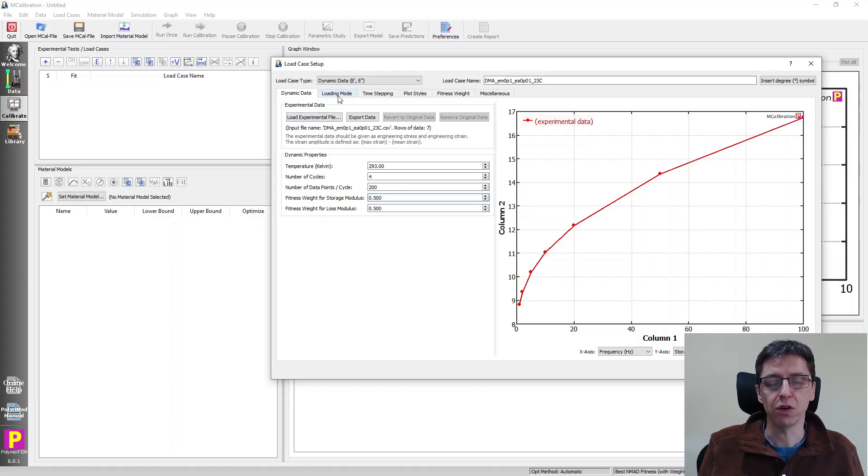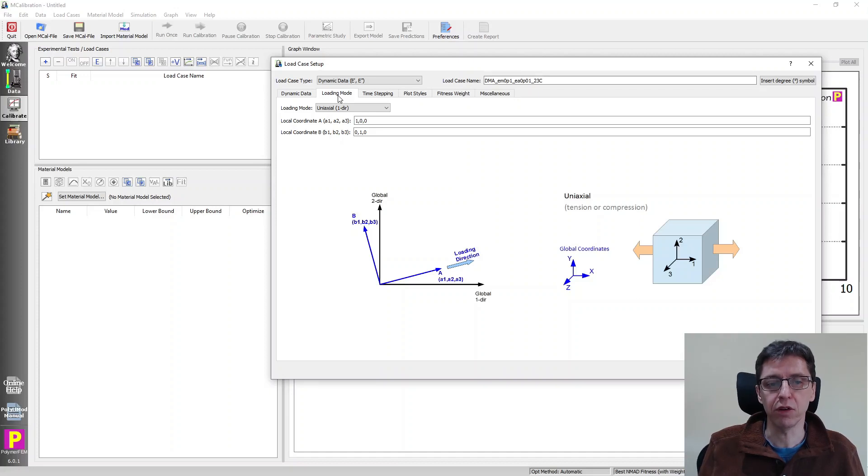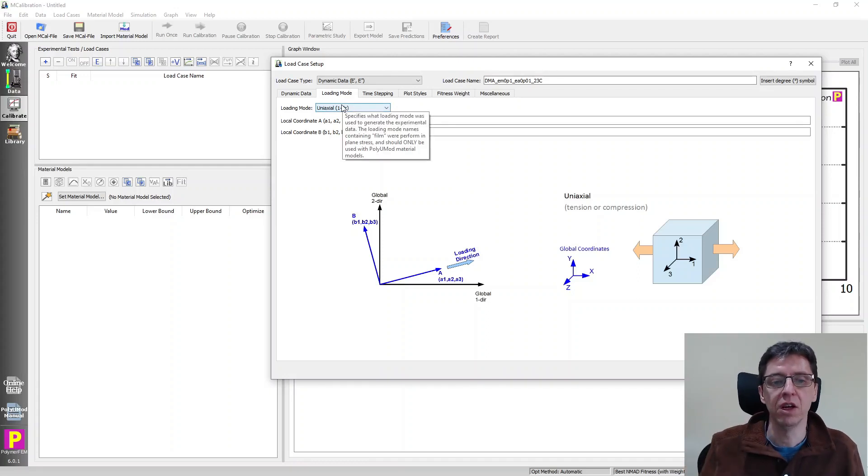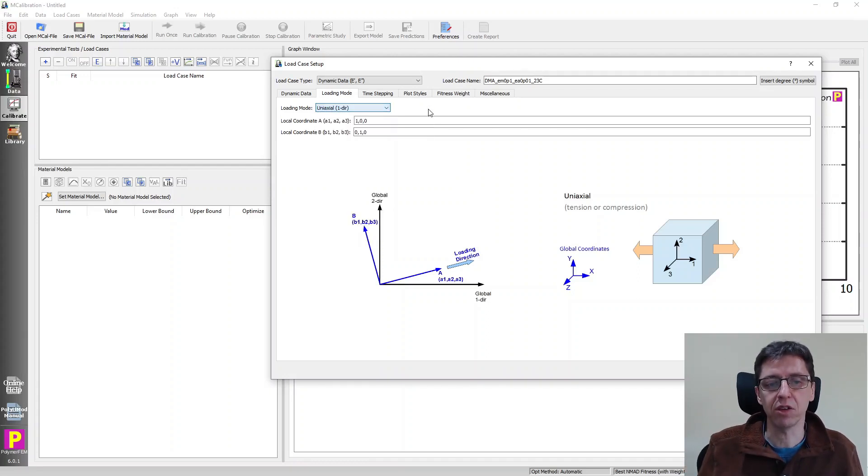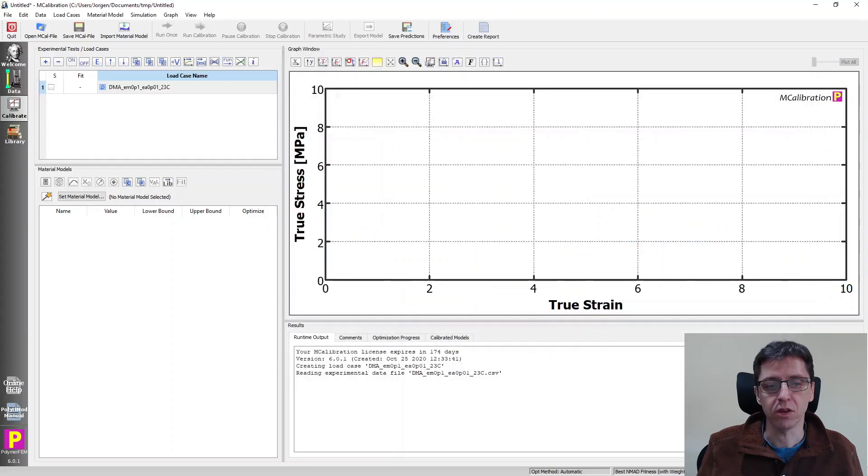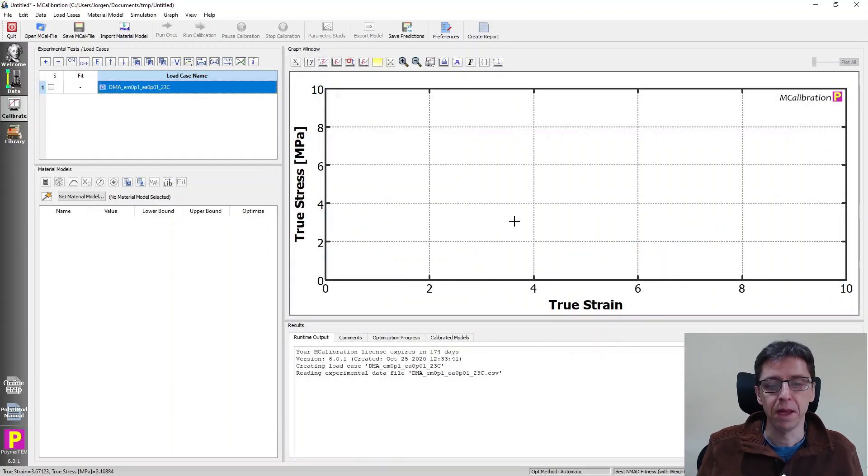I'm then going to go to loading mode. This is important because here you have to specify what type of DMA test was done. Was it a uniaxial test in tension? Was it a shear test, biaxial test or whatnot? So you have to specify that obviously. And here I just can assume it was a uniaxial test. So I say okay. And now I've read in my data here.